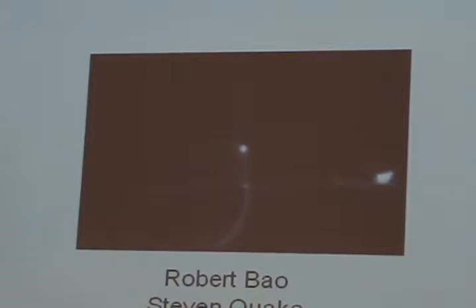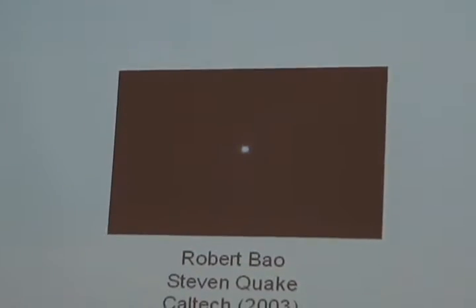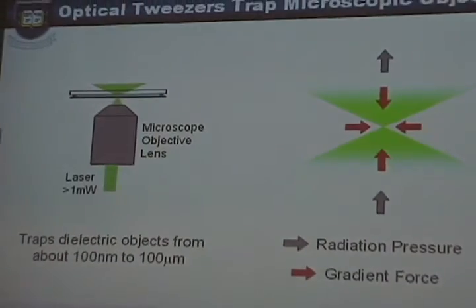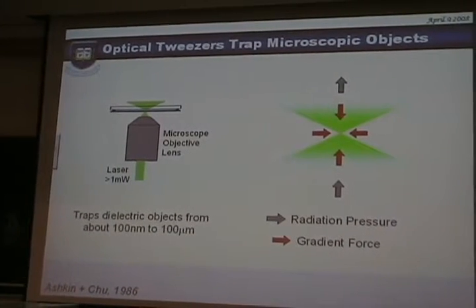In the first part of my talk, I want to give you a basic idea of how this works, and then later I'm going to give you an idea for the applications. But the applications are not dollar sign applications, they're light bulb applications, scientific applications. Specifically, I'm going to talk about how you can use optical tweezers to do quantitative measurements of forces.